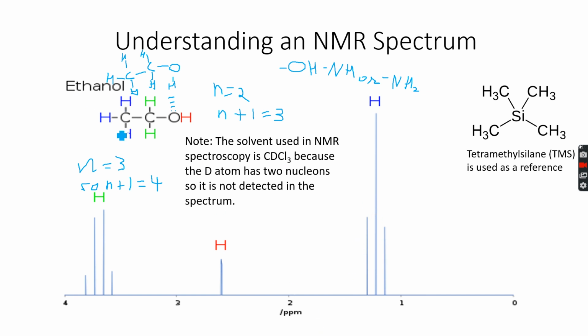So first we have a CH3 group over here. We have a peak over here for these three hydrogen atoms, and it is around 1.1 or 1.2. And when I look at the data booklet, we get a peak between 0.9 and 1.7 ppm. So as you can see, we are getting a peak between 0.9 and 1.7 ppm for the CH3 group. So yeah, this is correct.